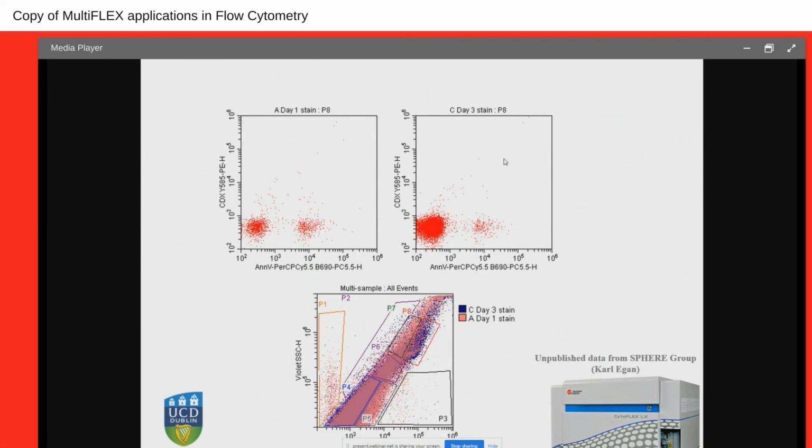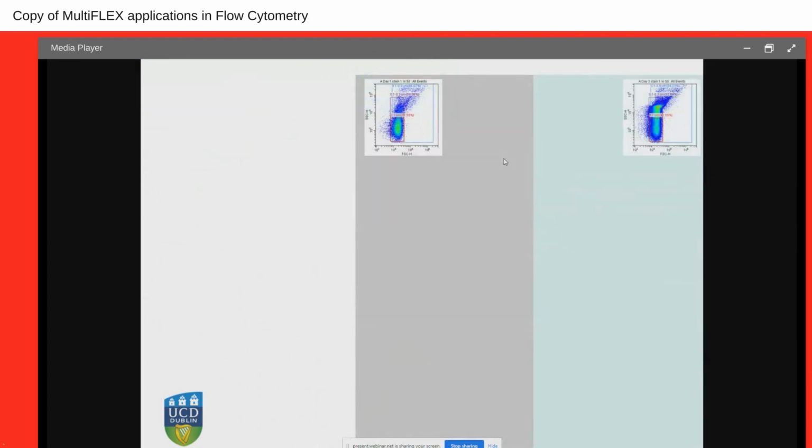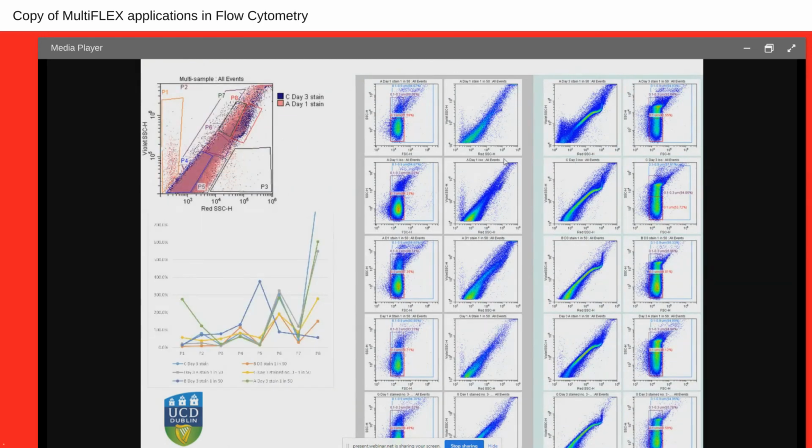So it means that the origin of those EVs that they are changing in their scatter is clearly different between the position on more red and less violet. We could think that this is an artifact that could be an issue with one of the samples. We repeat in different patients and different days, and we can see they follow more or less the same pattern. We look at the statistics, and this allows us to identify different biomarkers for different patients.